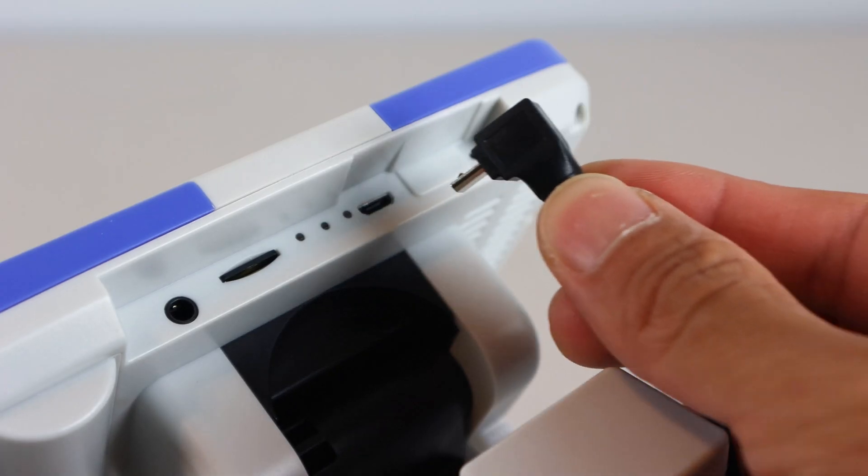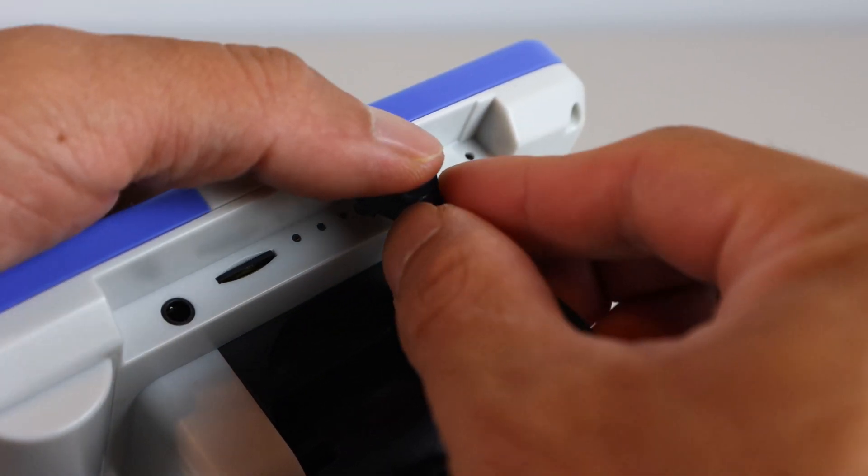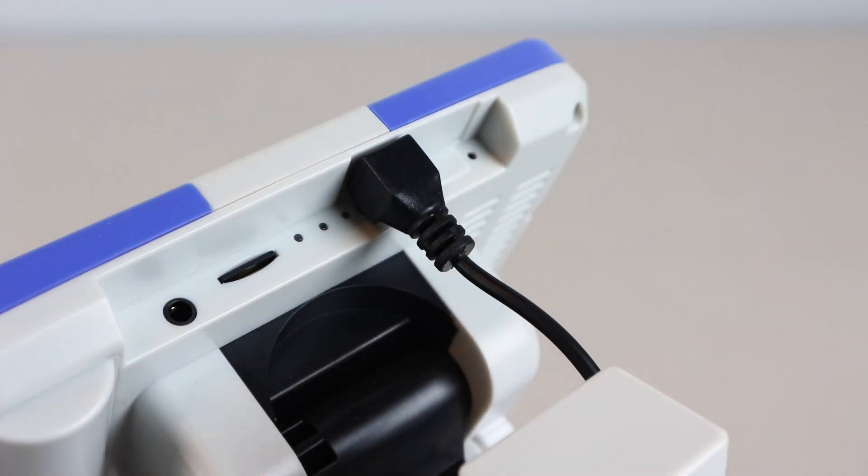The right angled USB connector on the charging cable connects to the power port on the LCD screen. When plugged in and charging, the first LED illuminates red, and it shuts off when the unit is fully charged.